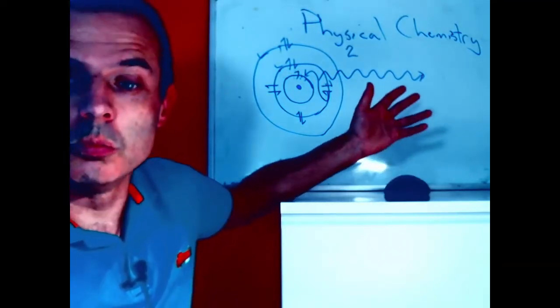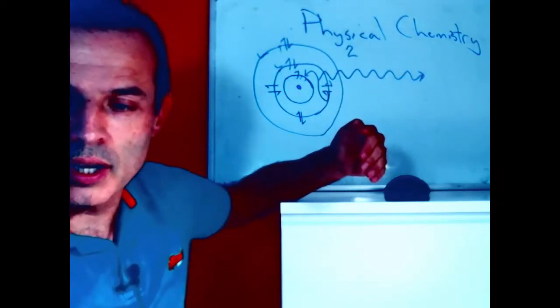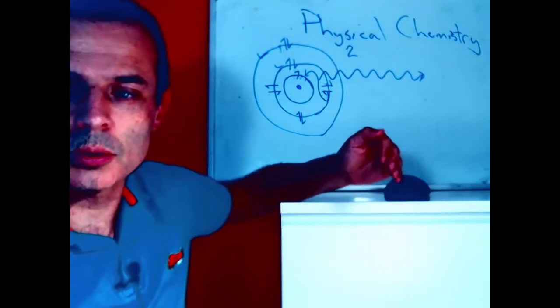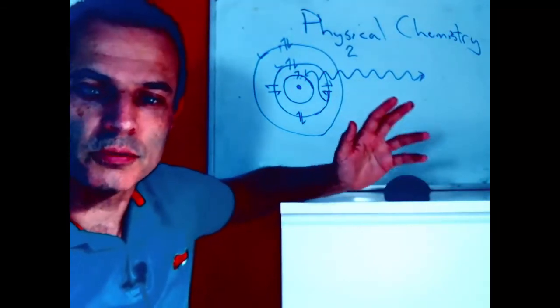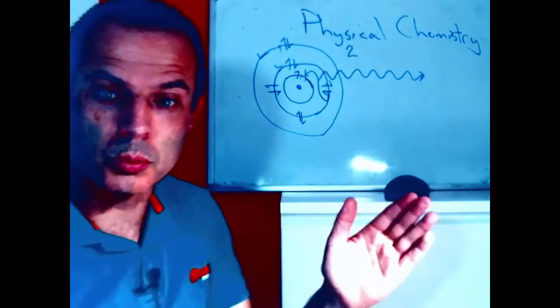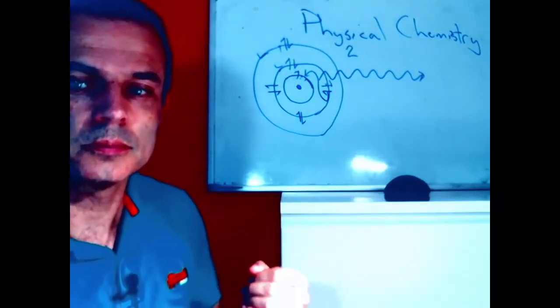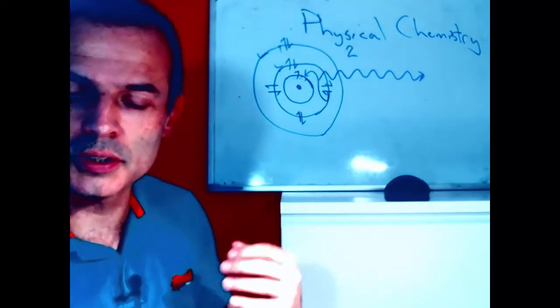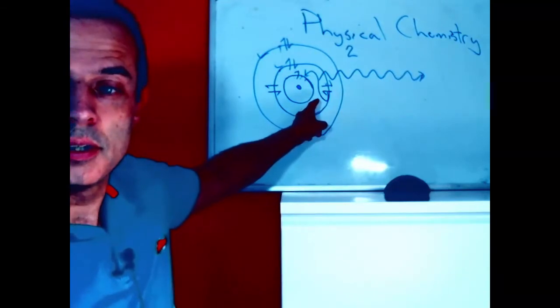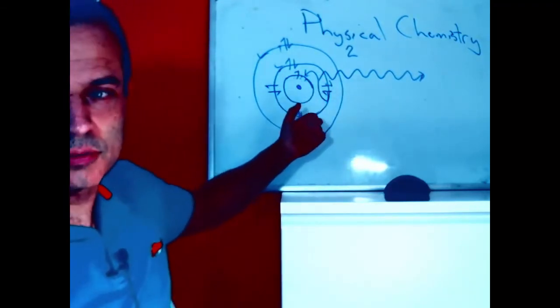And because we could have a lot of elements in there, like infrared, it is best if we know a lot about our sample before we start. If we don't know what's in there, it can become very difficult because all of our bands are shifting depending on what they're attached to. If we know what it is, then it tells us more information. In this case, we have an advantage and a disadvantage at the same time.